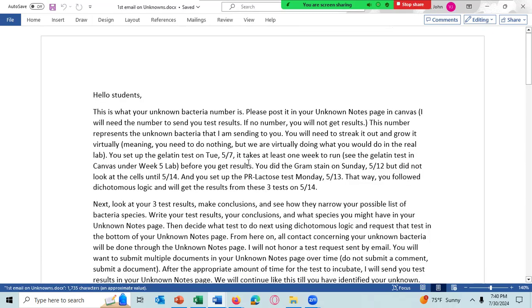I have a question. For this test, do we message you requesting it, or is it something we will automatically get with the rest of the study? I'm going to automatically send you the first 3 tests. After that point, you have to request a test in your unknown notes pages. For the first test, I've already decided you are going to be doing the gelatin hydrolysis test because it takes a week, and that you're setting up today.